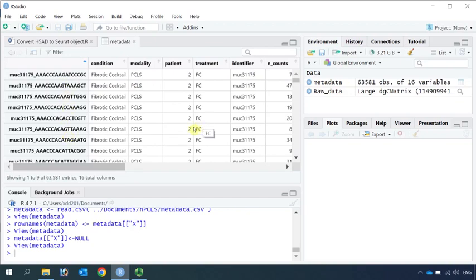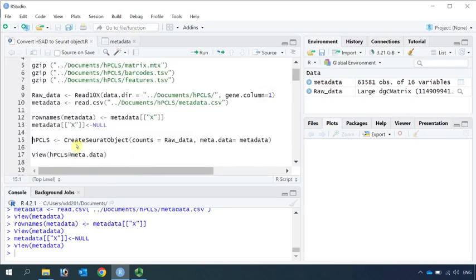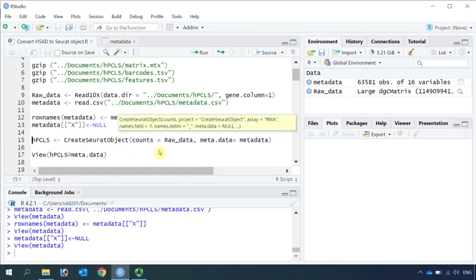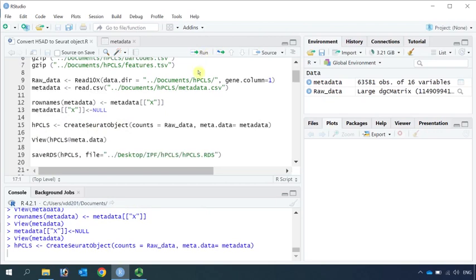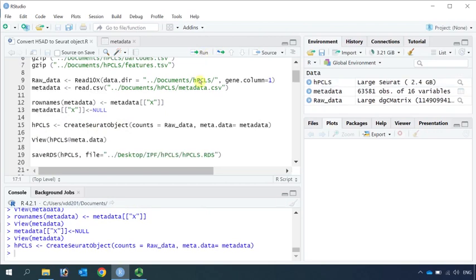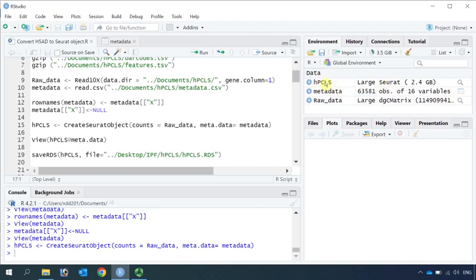We can use it to create the Seurat object. So now we can use the CreateSeuratObject function to create a Seurat object. We will name it as Human Precision Cut Long Slices. Let's create this Seurat object. You can see we now have a Seurat object named Human Precision Cut Long Slices.